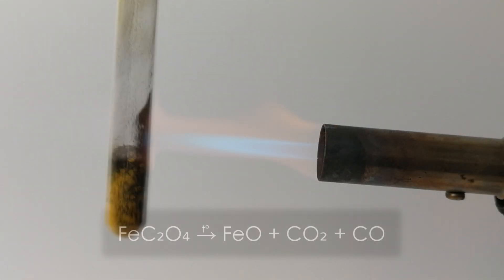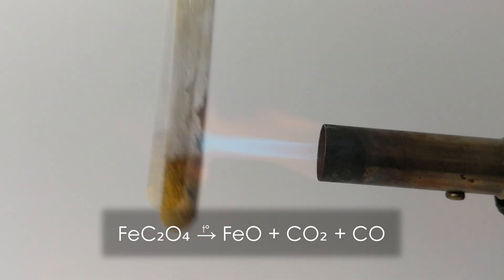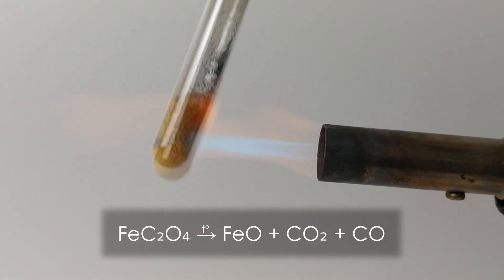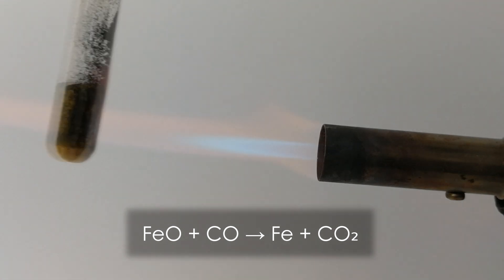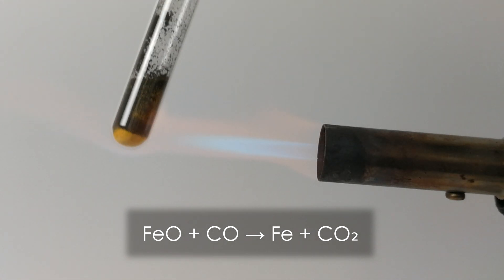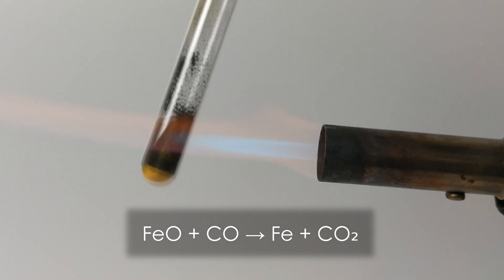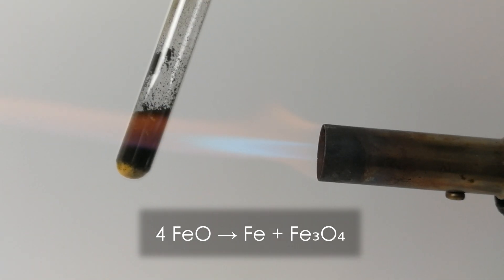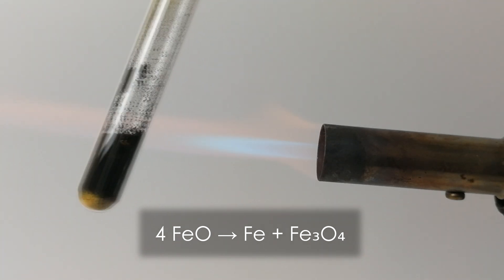Upon heating, ferrous oxalate decomposes to ferrous oxide, carbon dioxide and carbon monoxide. The carbon monoxide partially reduces ferrous oxide to iron metal, forming carbon dioxide. Part of the ferrous oxide can also disproportionate to iron metal and magnetite.